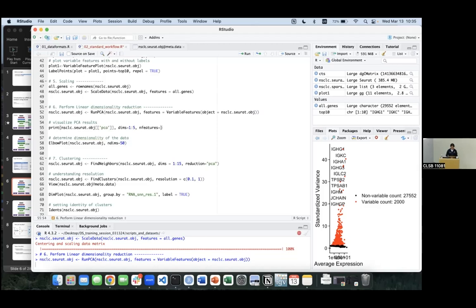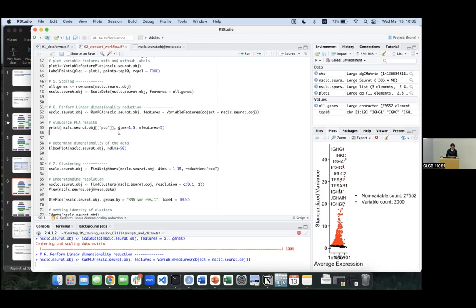And features. So it'll print you how different features contribute to the projection of the PCs, how it's been projected back to the PCs. You can see whether it's a positive PC correlation or negative ones.